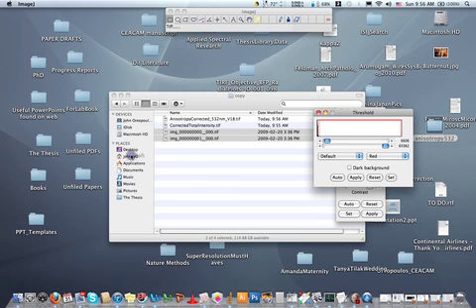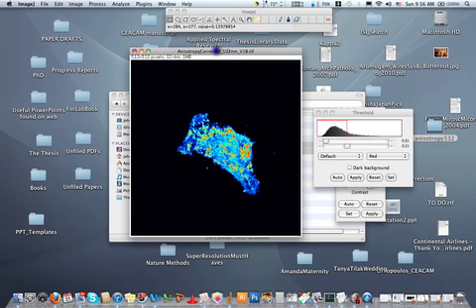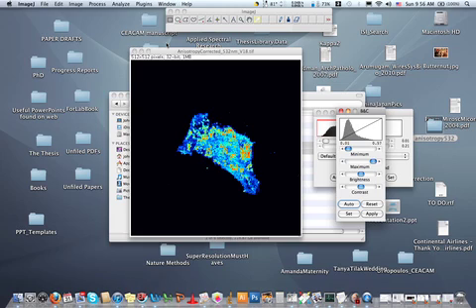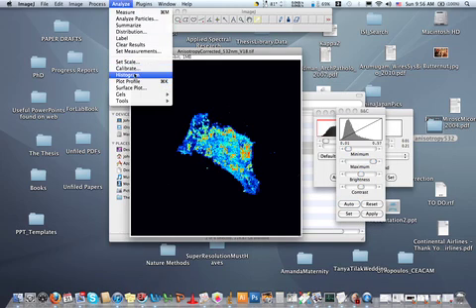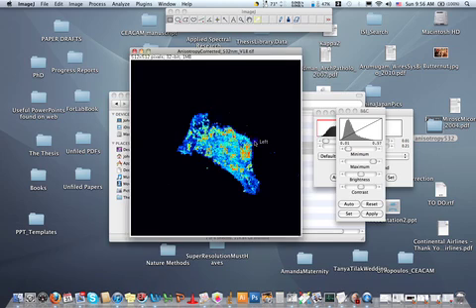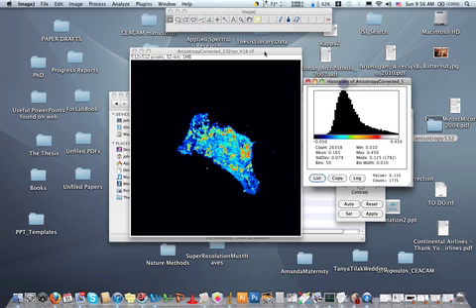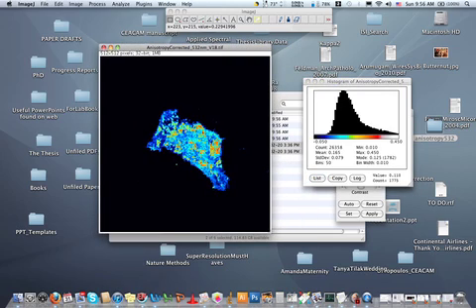And some magic happens. There's my wonderful anisotropy image. It's been auto scaled. We can look at this in a histogram. For the histogram, I like using the range minus 0.05 to 0.45, and there you can see the histogram. Whatever you do when you present an image in a paper, just make sure that the color scale, i.e. the contrast for the image and the contrast for the histogram, are the same. That's very important. Otherwise, this histogram does not reflect what's here in the image.